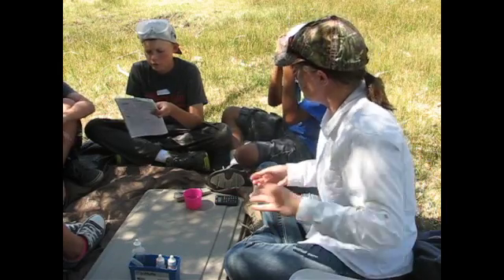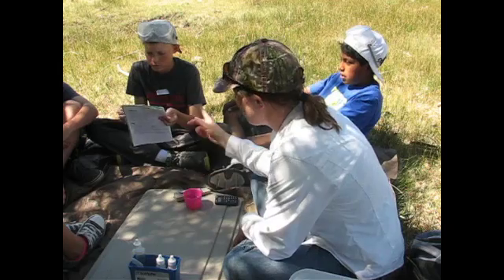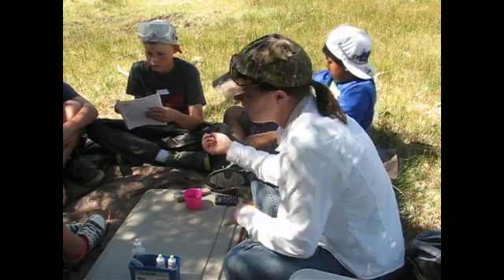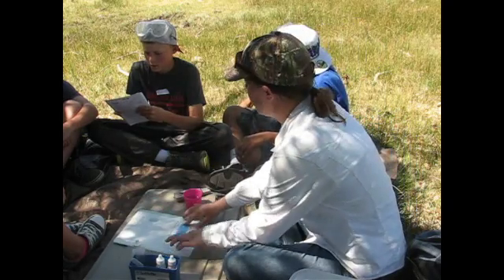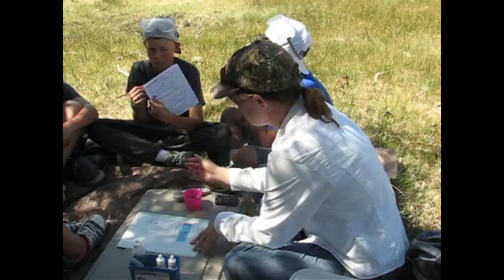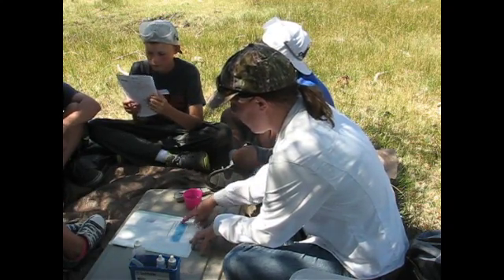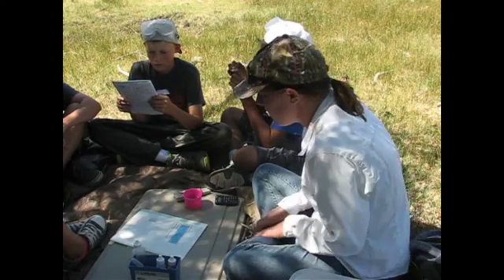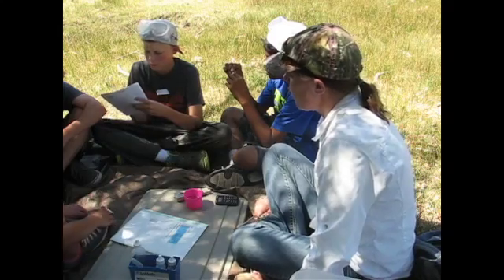Which minerals was the hardness test for? We forgot to do that. We'll go over it. So 20 parts per million. To tell if that's hard water or soft water, you write it down. If you look here for our number, you'll see what kind of quality water we have. So what kind of water do we have? Soft. We have soft water.